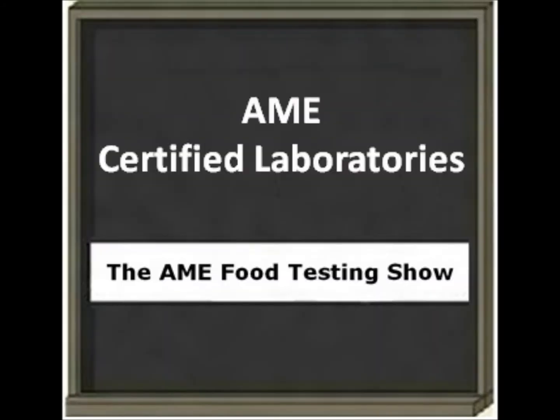Like the drug industry requires a lot of testing before they release materials out. We built tests for human pathogens, animal pathogens. So generally, I'm interested in health and safety applications where you can use molecular diagnostic tests to make sure, for instance, the products that you put out do not contain any adulterant or pathogen. I'm also interested in developing similar assays for the clinical diagnostic market, where you do testing to see if people are infected with pathogens. So that's been the general strategy that I've been using.